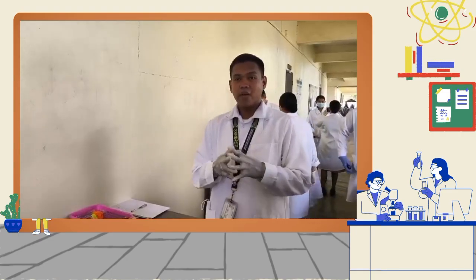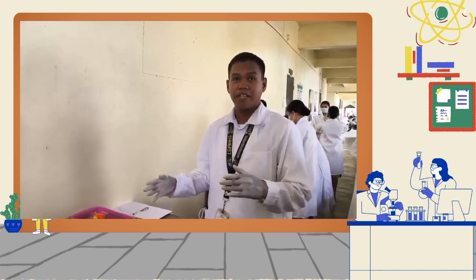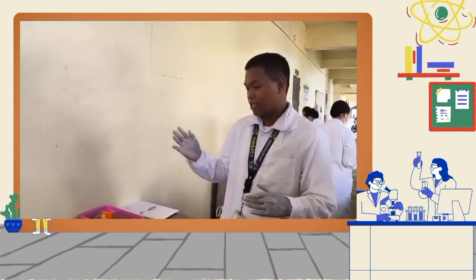Good day, everyone. Welcome to the second laboratory, which is the substituents and adulterants of Cannabis sativa. We are first naming the materials that we have.